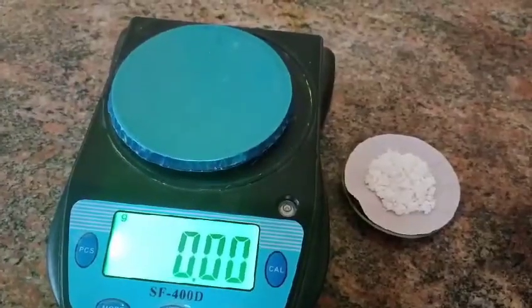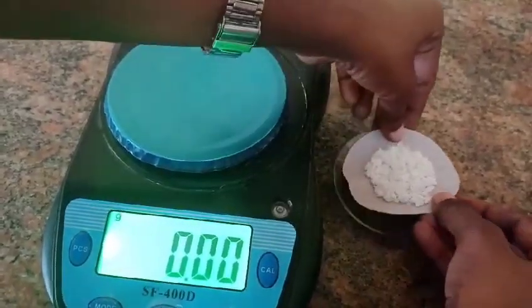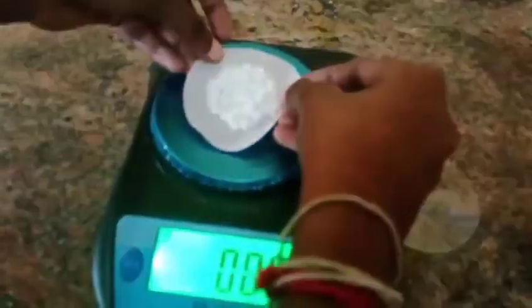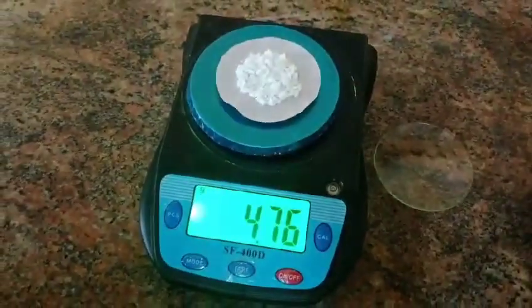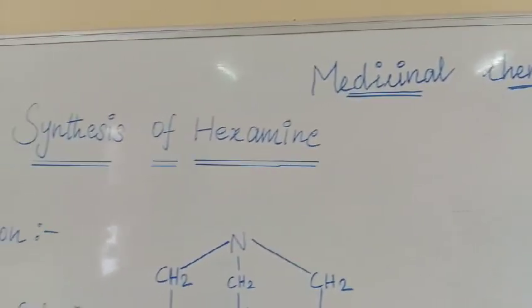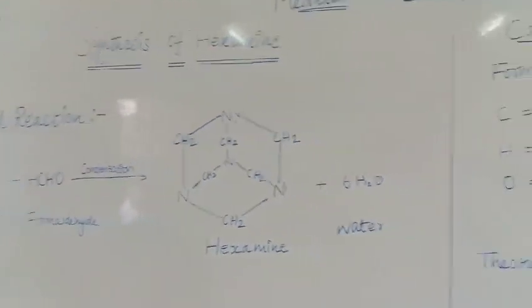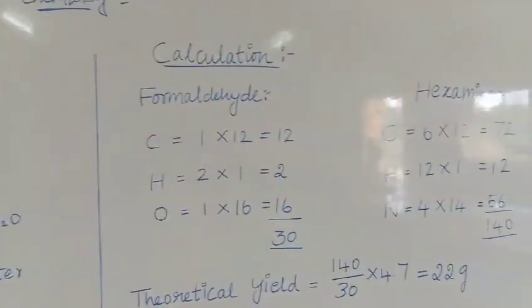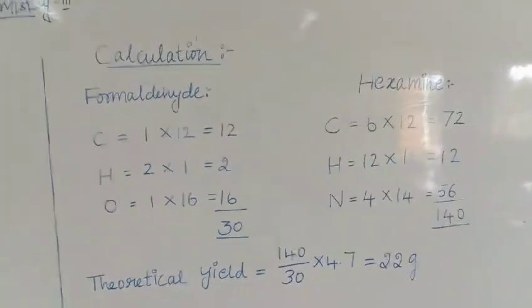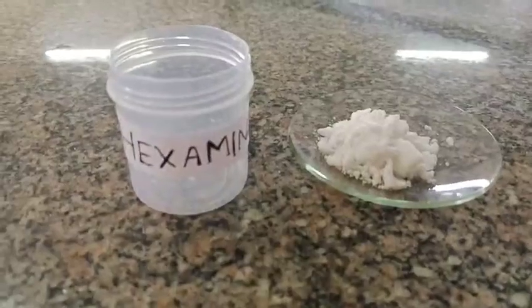We are going to weigh the final product. Our product Hexamine is ready.